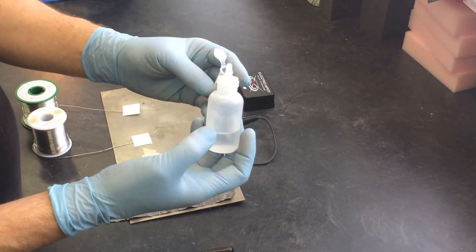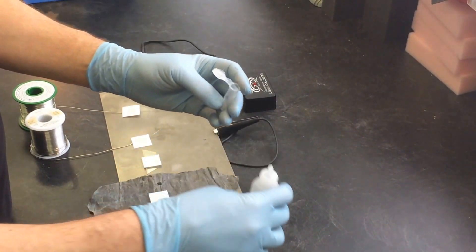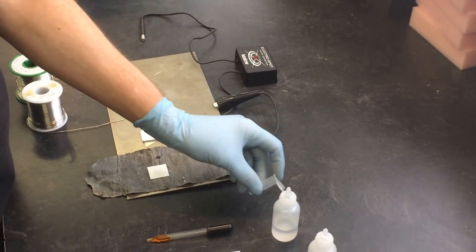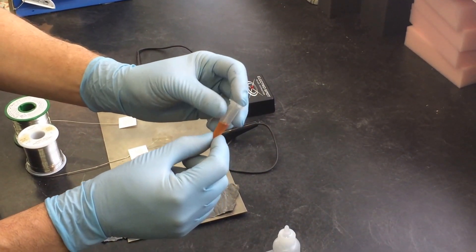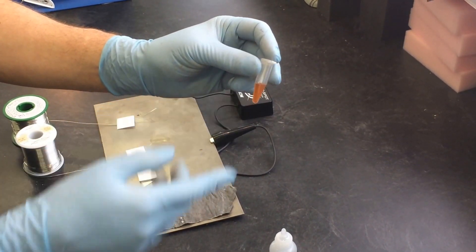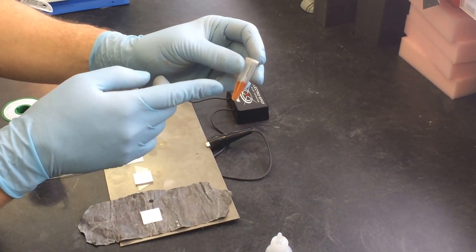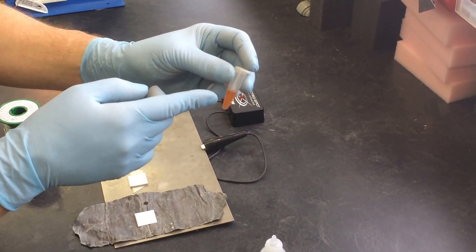And then we supply an empty bottle, which we just fill up with tap water. You add the water to the powder until it looks like this, like orange soda color. And this quantity, that's plenty. That's enough for dozens and dozens of tests, that small amount.